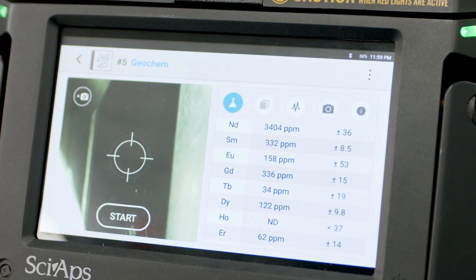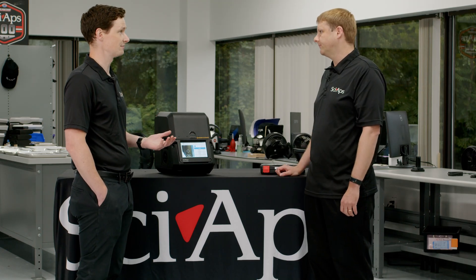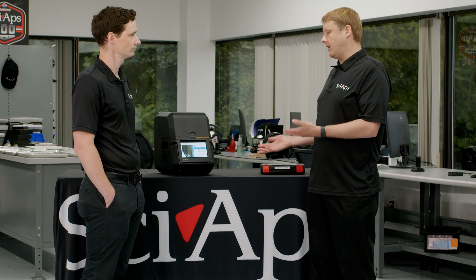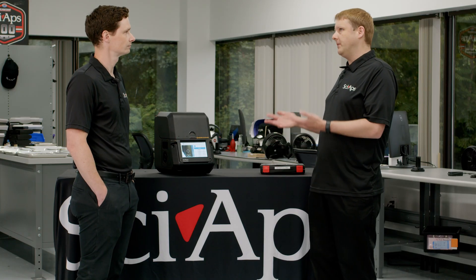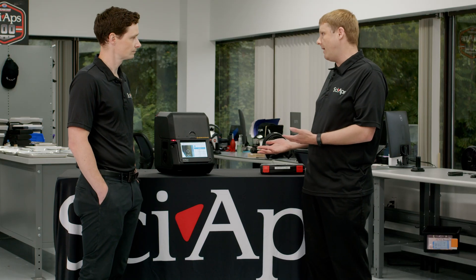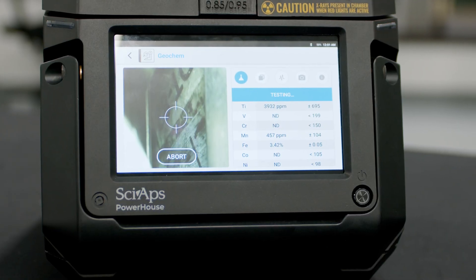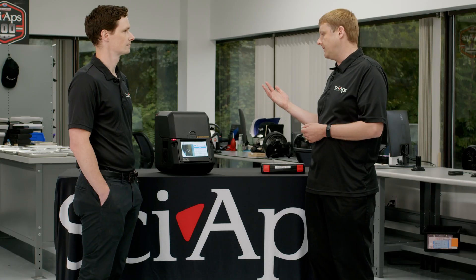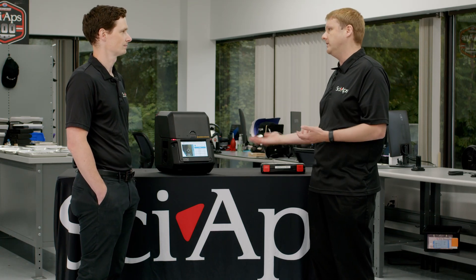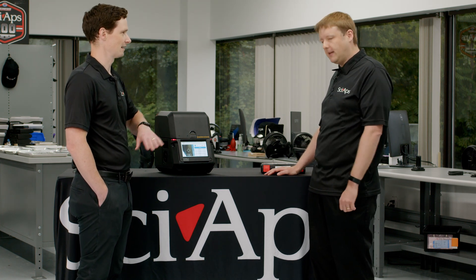A typical handheld would only go up to 50 or maybe 55 kV, so going up to 80 kV gives you big boosts in performance. You can measure lanthanides and rare earth elements on a handheld analyzer, but the lines you can see on those will overlap with some really common elements that show up in mineral samples like titanium, iron, copper, and a few others. With the 80 kilovolt system, you can access the K lines of them, which don't have overlaps with those other common elements, so you can get down to much lower sensitivity levels and much lower detection limits. You really simplify things by looking at those high energy lines with all the overlaps.